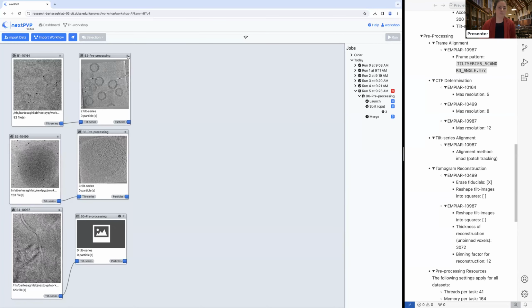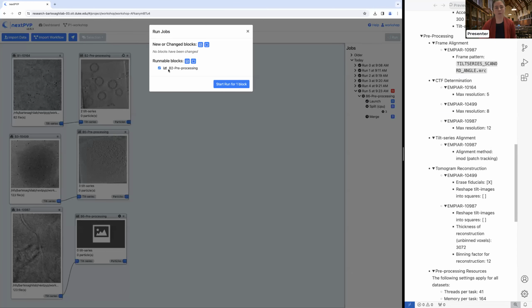So what I need to do is make the block runnable. So I click on the 3 lines here where we had our rename feature and our copy feature. And we're going to go ahead and you can hit make runnable. And now it gets this little recycle button symbol. Then you can hit run. And now it pops up in the runnable block.